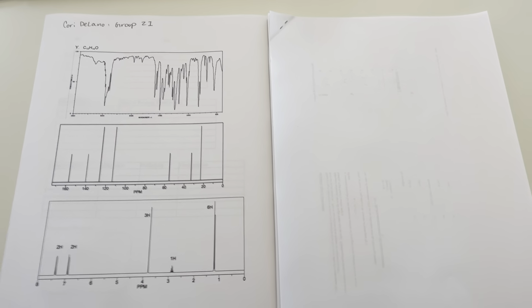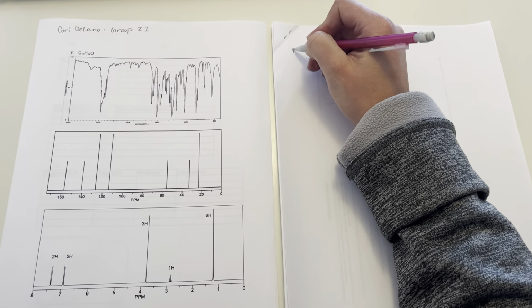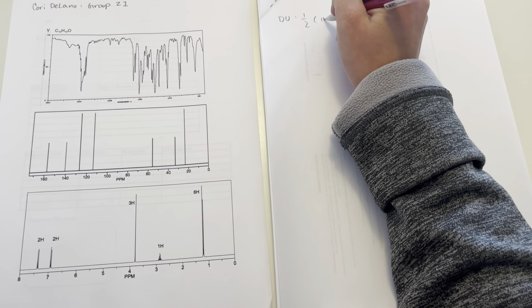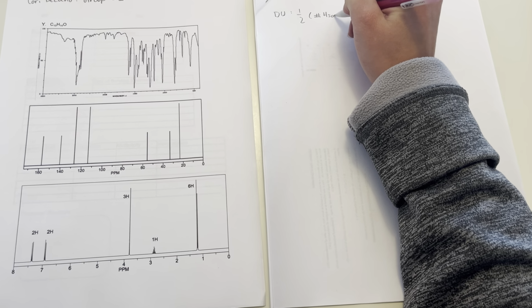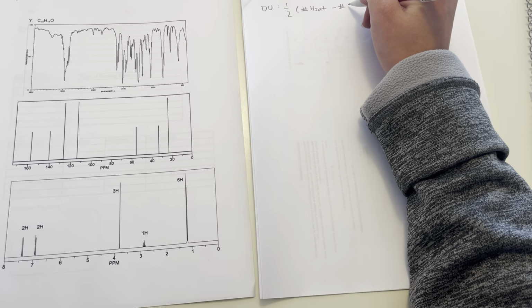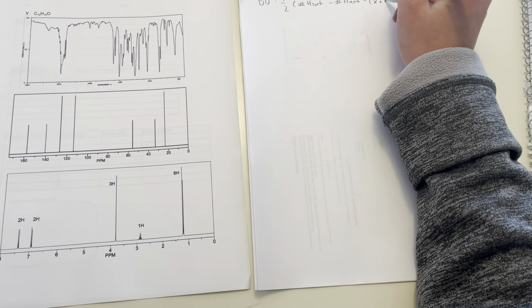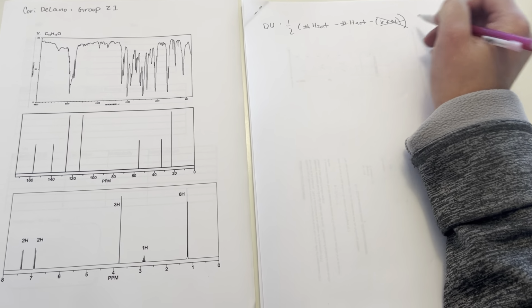My group is 21, and the molecular formula listed here is C10H14O. We want to start this process by calculating the degrees of unsaturation, the DU, which is going to be 1/2 the number of saturated hydrogens minus the number of actual hydrogens minus halogens and nitrogens. We don't have any of those in our formula.